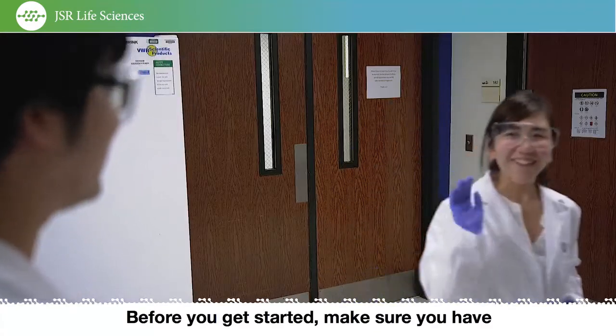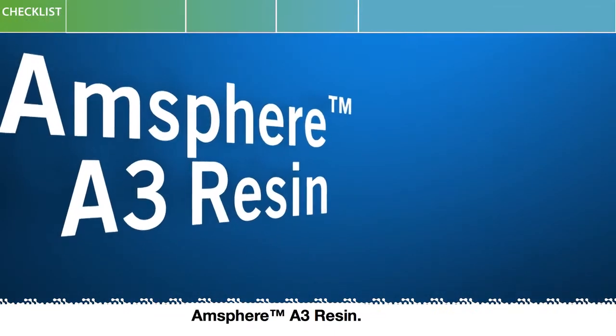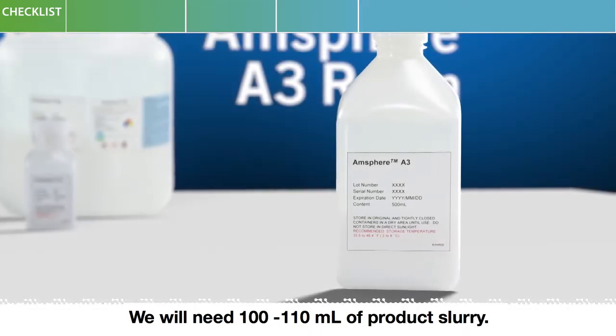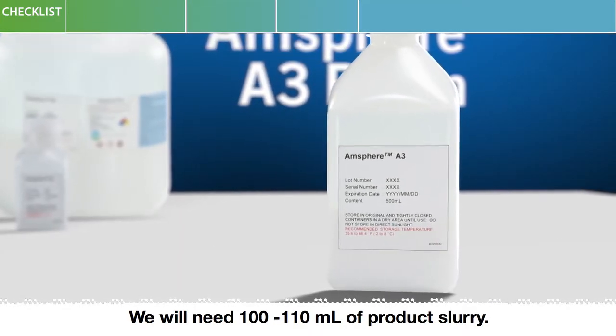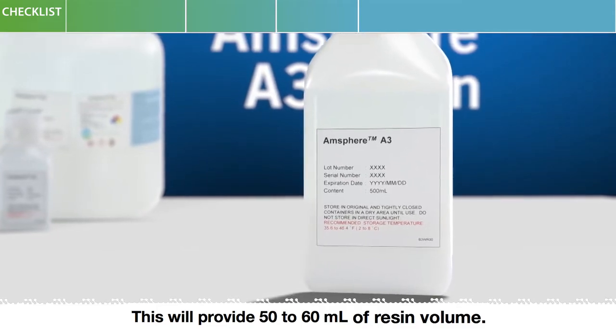Before you get started, make sure you have all the materials you need at hand. AMSphere A3 resin: we will need 100 to 110 milliliters of product slurry, which will provide 50 to 60 milliliters of resin volume.